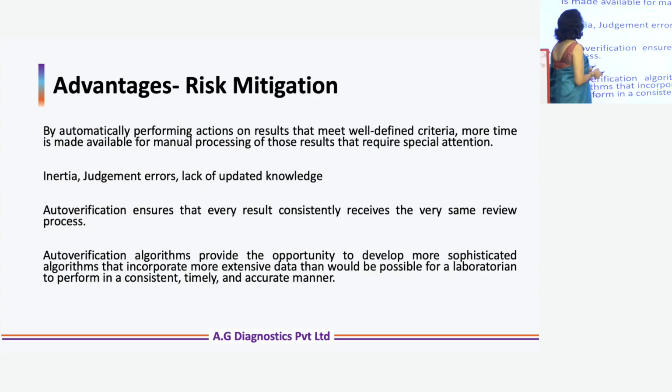So by automatically performing actions on results that meet well-defined criteria, more time is made available for manual processing of those results that require special attention. Though we may not like to admit it, inertia, judgment errors, and lack of updated knowledge plague all of us, right? So auto verification ensures that every result consistently receives the very same review process, whether it's 9 o'clock in the morning, 9 o'clock in the night, junior pathologist on duty, senior most pathologist on duty. This process will remain consistent.